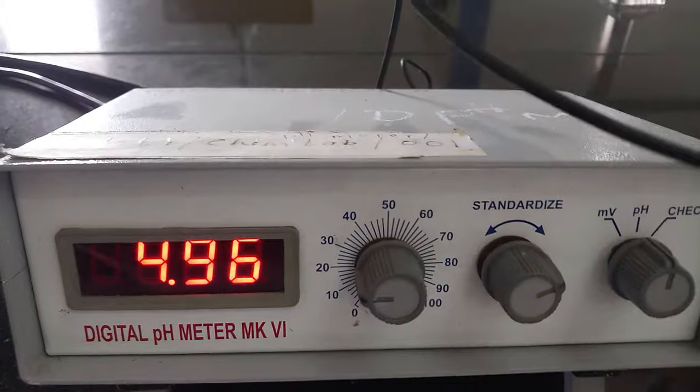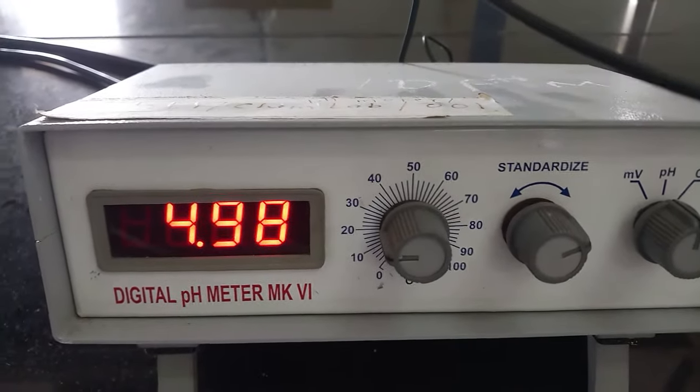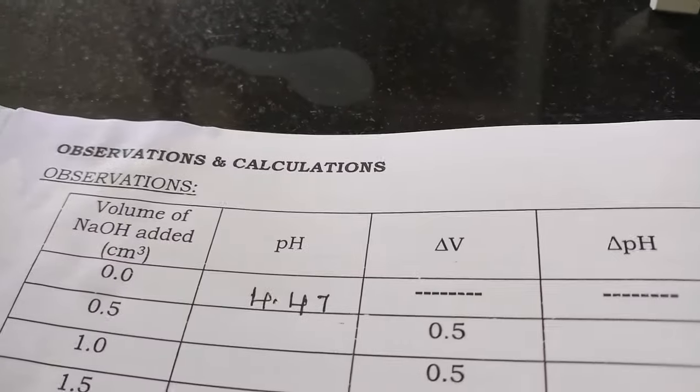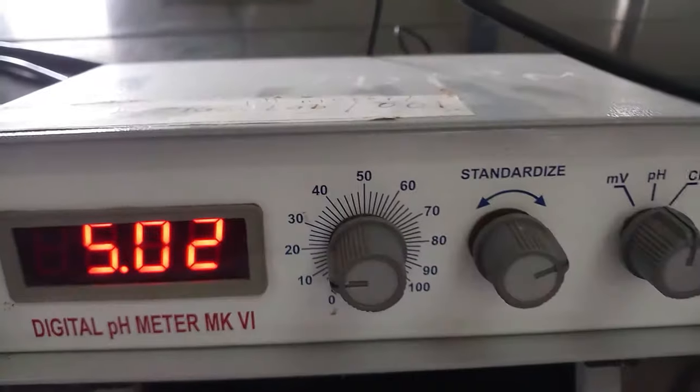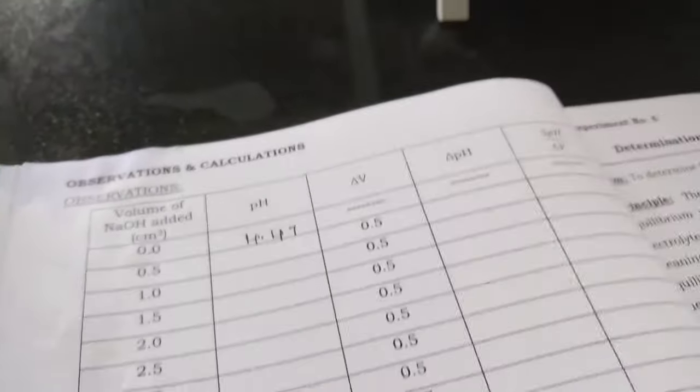So initially we had acetic acid, weak acid, therefore pH is less, 4.47. Now upon adding NaOH, pH slowly increases. So that change in pH we have to record here continuously.